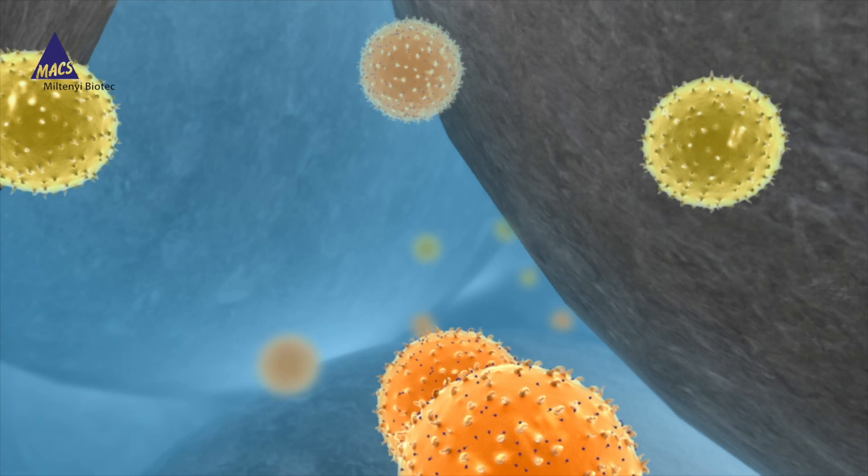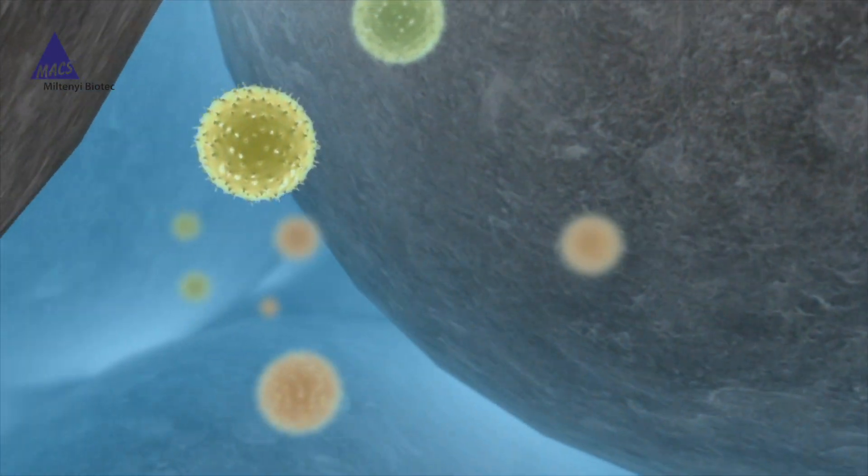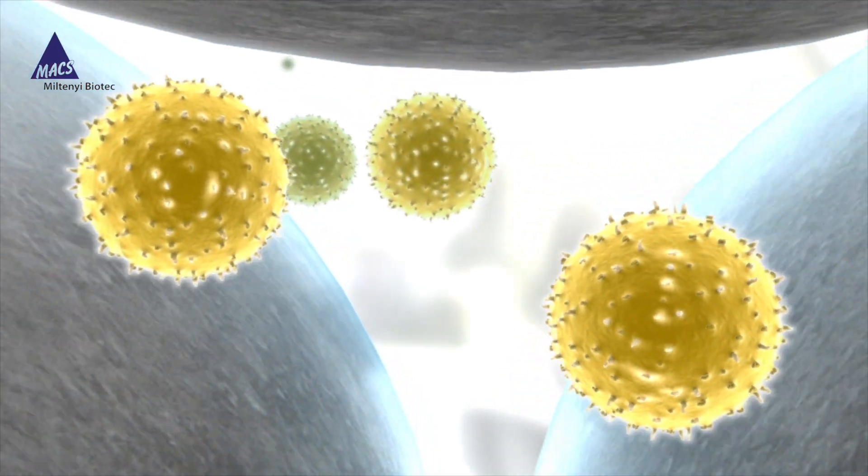Cells that pass through the matrix within the Max Column have a lot of space, causing no stress to the cells. Labeled cells hover between the iron spheres while unlabeled cells pass through.